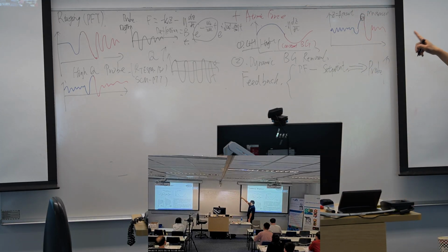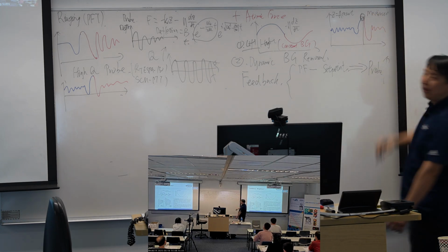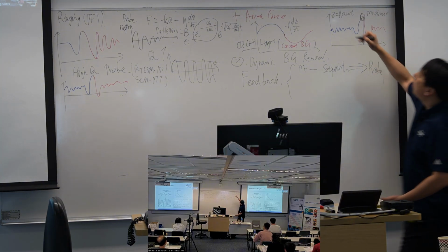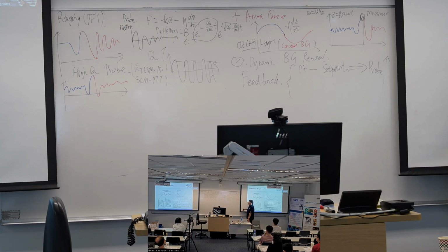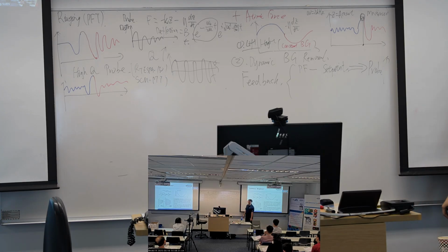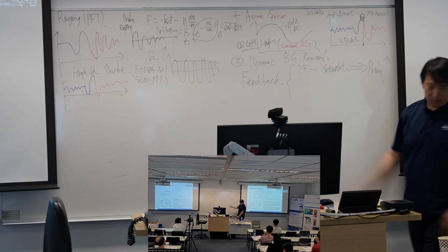For a defined sine wave, the lowest point should be reached at a defined time point. For example, if my frequency is 2 kilohertz, it means the period is 500 microseconds, so I should be able to reach the lowest point at 250 microseconds.